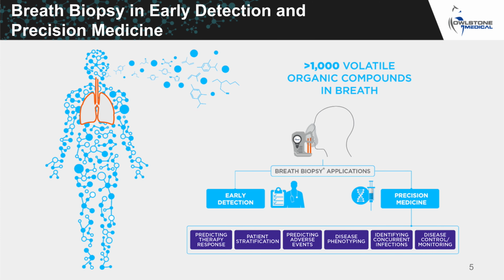So the main question is, why analyze breath? Every breath contains thousands of volatile organic compounds, or VOCs. In the following set of slides, we'll look at what these VOCs are and where they come from, and also look at why they are promising non-invasive biomarkers for everything from cancers to infectious and inflammatory disease.